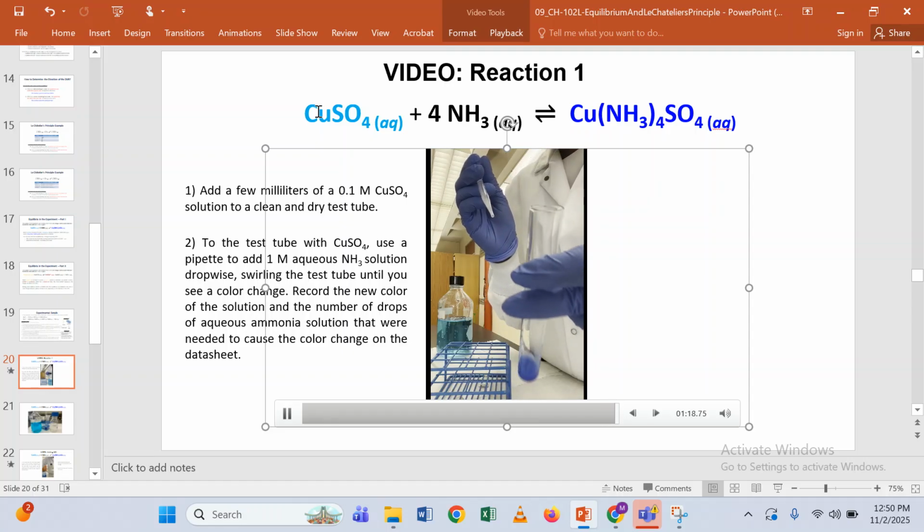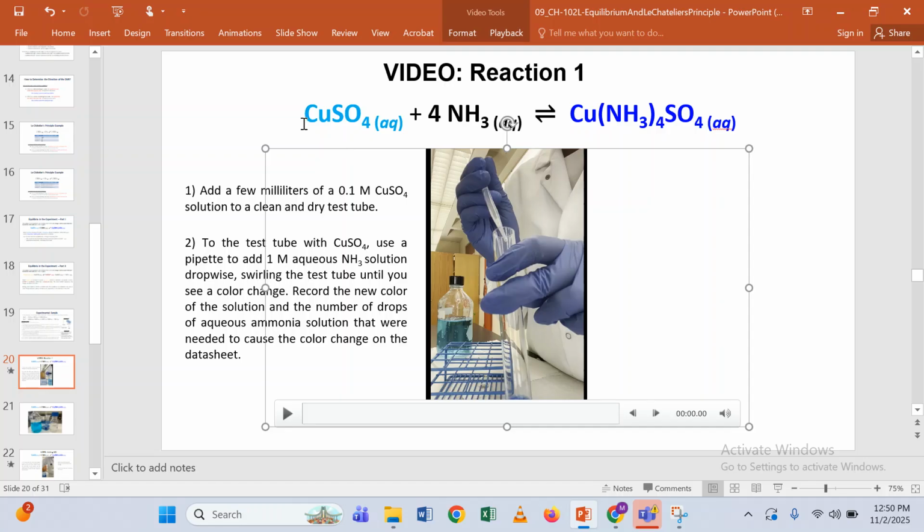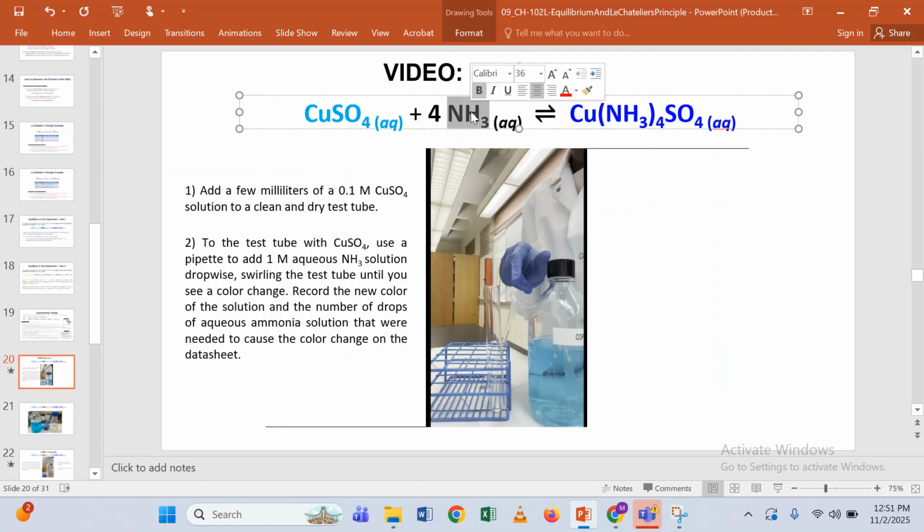All right. You see, this shows us we start with a turquoise color, and if we add more reactants, it will shift towards the product side. So you would say, and this is in your lab report now, adding NH3 is going to give us a right shift. It will shift to the right side, and we added 7 drops of NH3. When you add reactants, when you add something to the left side of the arrow, it will make you shift to the right.